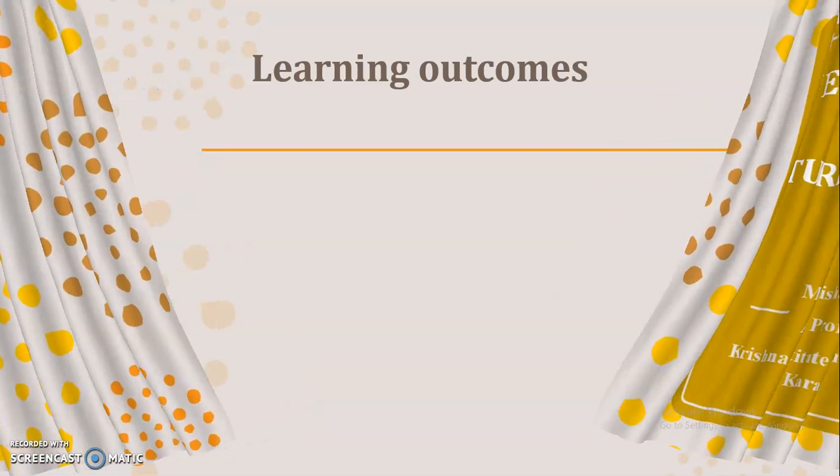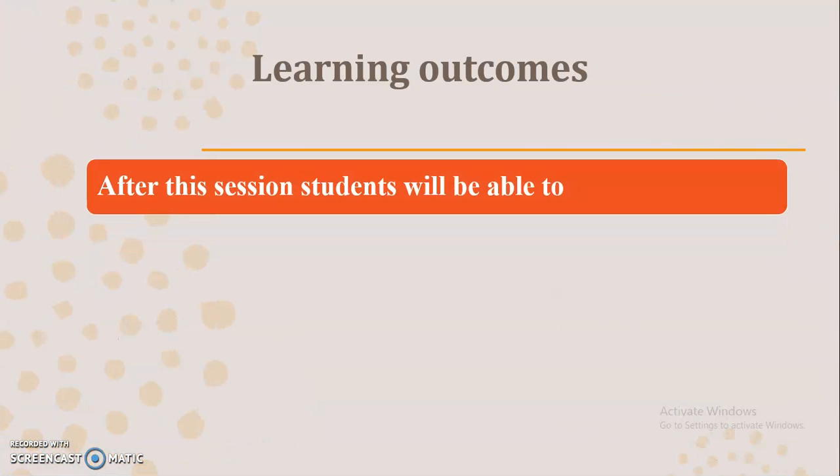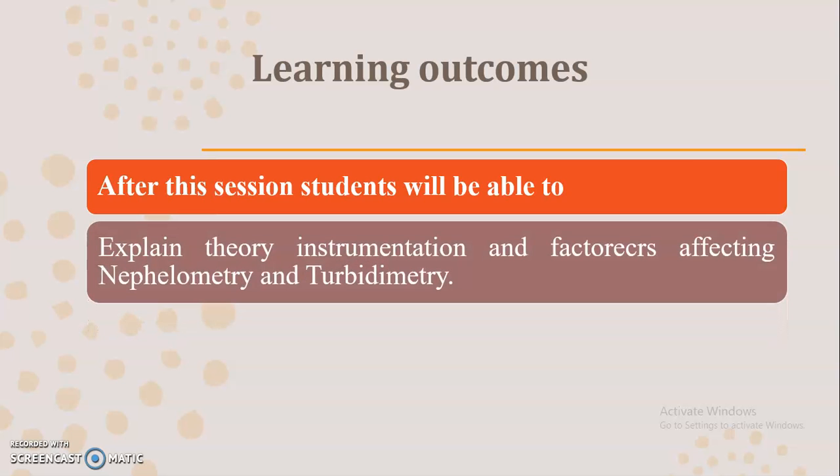Before starting with this session, we will see the learning outcomes. After this session, students will be able to explain the theory, instrumentation and the factors affecting nephelometry as well as turbidimetry. Together, both the instruments are known as the nepheloturbidimeter.